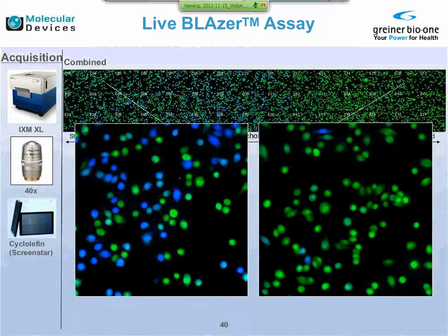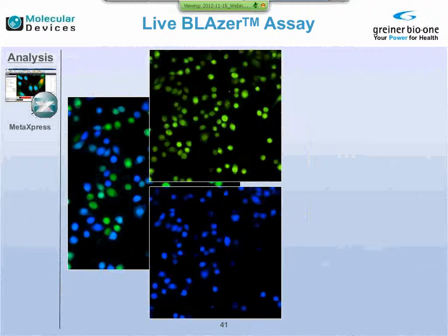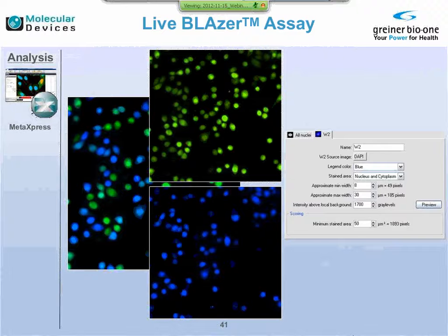Now, looking at the image analysis, we have taken these images and used one of our ready-made image analysis application modules in MetaExpress. This one is called multi-wavelength cell scoring, where you first decide how many wavelengths you have. The second wavelength we chose here to be in the DAPI channel, and we're looking at the intensities in the nucleus and the cytoplasm. You can give cutoffs for the minimum and maximum width of these cells, and also for the intensity. This helps us later on to classify these cells into positive and negative cells.